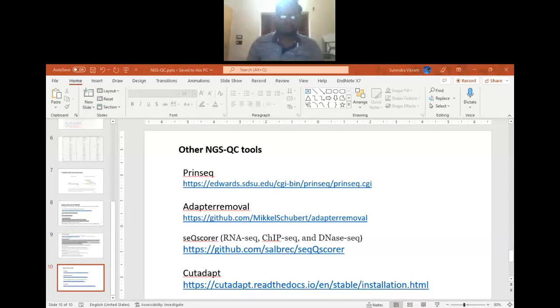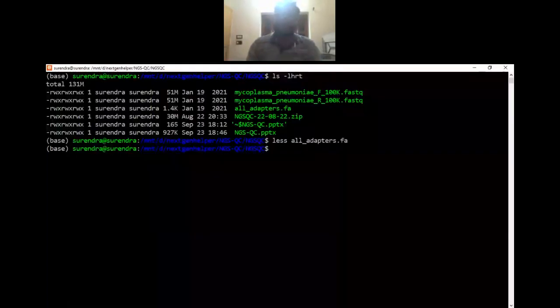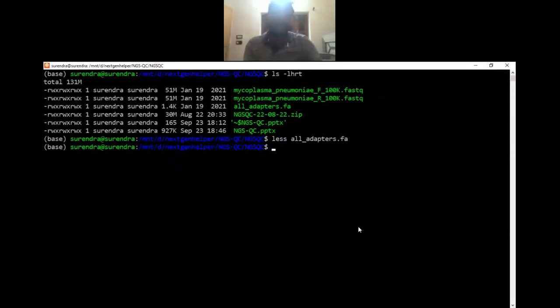Conda requires Python installed. Actually, Conda is Python based, you can say, and it tackles most of the times when you have multiple dependencies or different types of dependencies for different software or tools. So what you can do is create an environment and use one tool in that environment, and that will not clash or make any trouble with other dependencies.